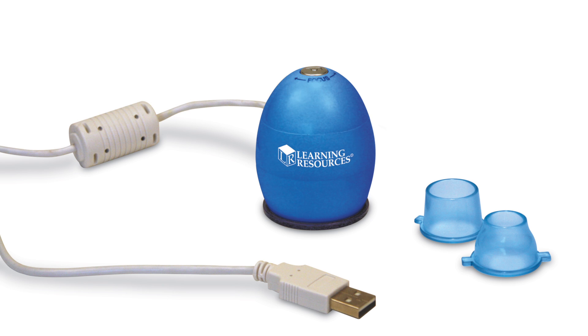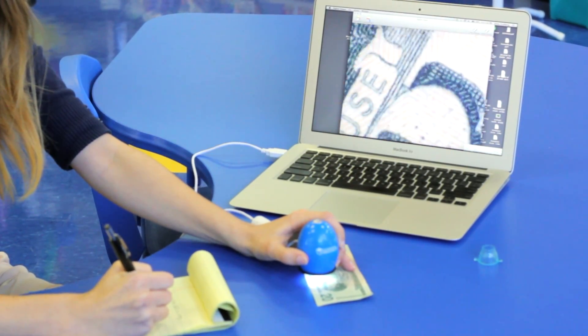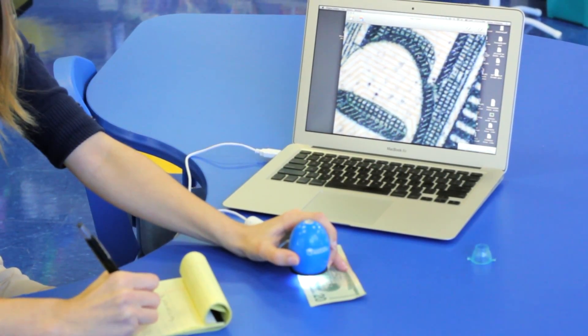Meet Zoomie, a fun and affordable handheld digital microscope that can display images of 35 to 53 times magnification on your computer or interactive whiteboard.